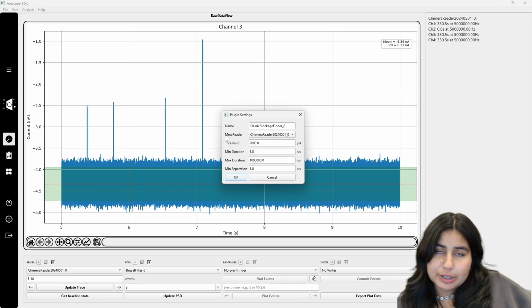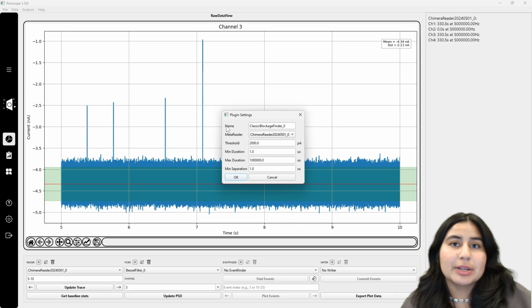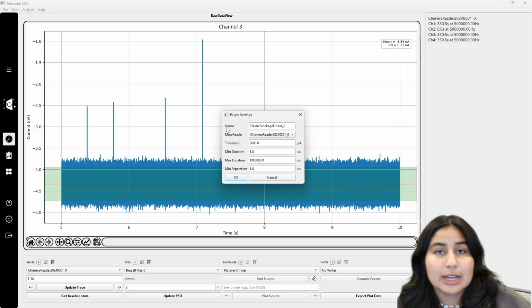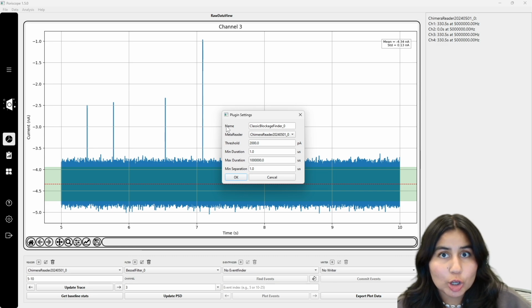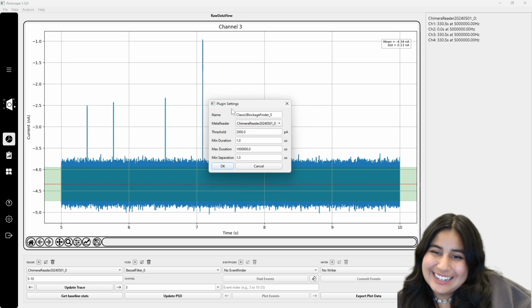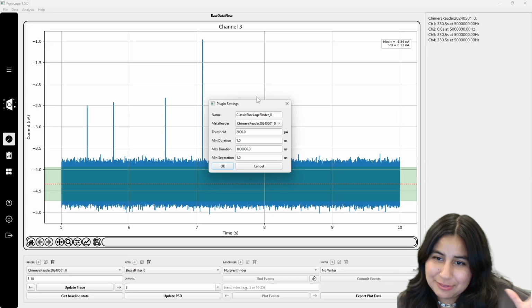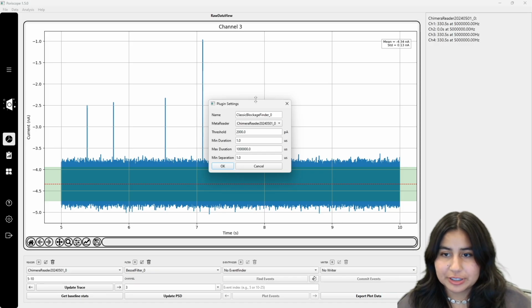Very important, meta reader parameters, super important. Event finders, as many of the other objects that come from the plugins in Poriscope, are locked to other plugins. This is all metadata, but basically the event finder has to be associated with a reader, locked to a reader.